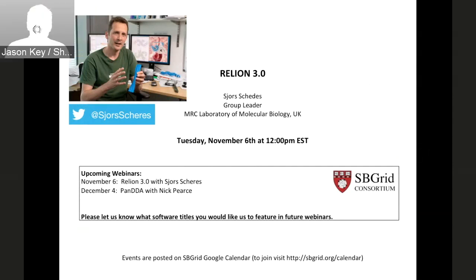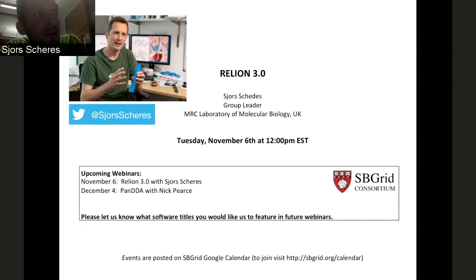Okay, there's just a couple more questions, and then I think we'll let you go. So, somebody called SPL would like to know how well ordered the multi-domain protein needs to be for multi-body refinement to work? Oh, it doesn't necessarily need to be very ordered.